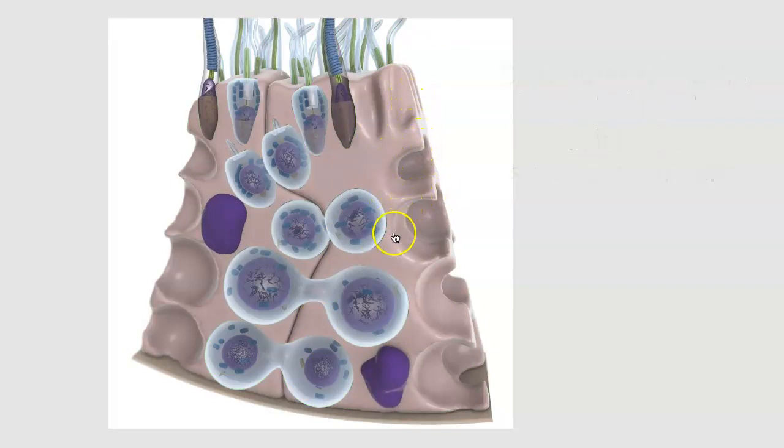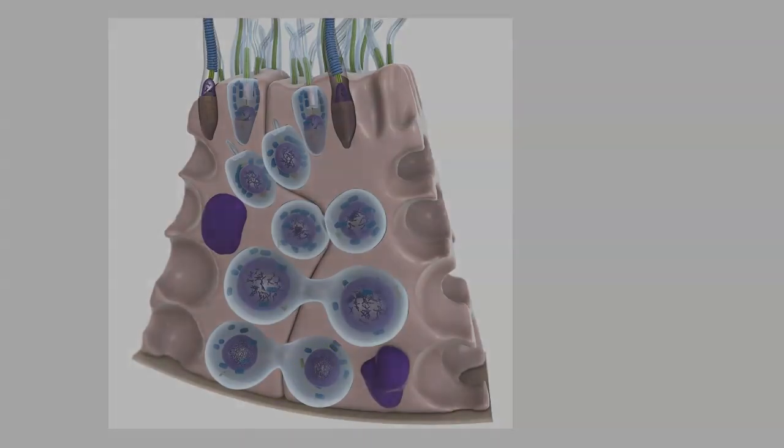And so we might see that better over here on the side, where we can see the indentations where spermatogenic cells were located, kind of like a fist into a water balloon. The spermatogenic cells jut into the sustentacular cells, displacing them as they get pushed towards the lumen, but these cells aren't actually inside of the sustentacular cell. They're outside of the plasma membrane.